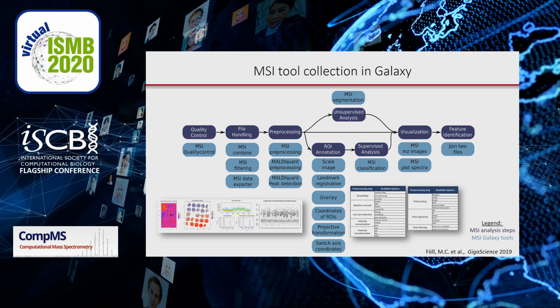One highlight is the automated quality report, which contains more than 30 descriptive statistical plots that allow to assess, for example, spatial gradients, batch effects, and mass accuracy. Another highlight is the availability of more than 30 different pre-processing algorithms.